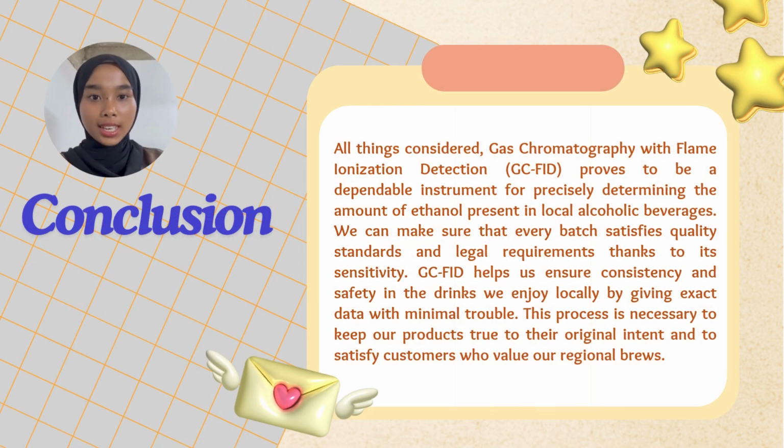In conclusion, gas chromatography with flame ionization detection proved to be a dependable instrument for precisely determining the amount of ethanol present in local alcoholic beverages. We can make sure that every batch satisfies quality standards and legal requirements thanks to its sensitivity.